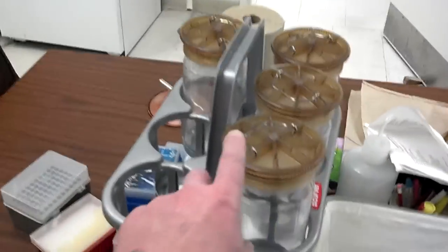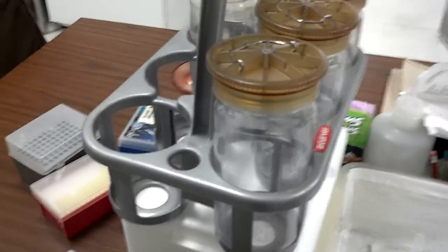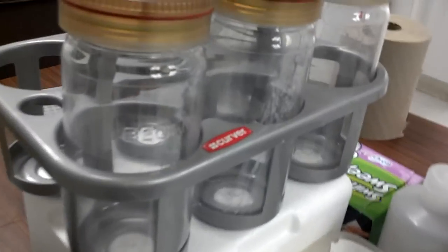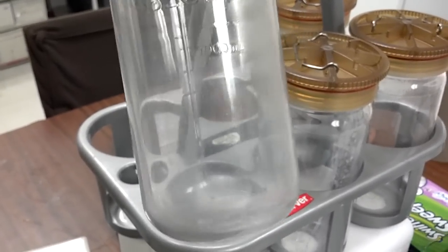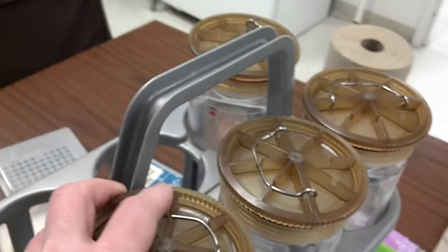These are centrifuge tubes. Look how big they are. Could handle a thousand milliliters of media. More than that really, but you wouldn't want to spin it. A thousand milliliters of media you can put in here and centrifuge it down until you get a pellet. And then you bust it up, wash it, digest it.